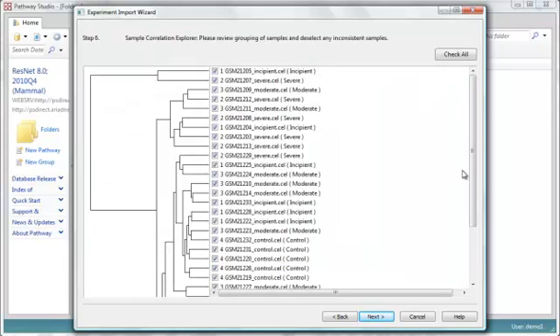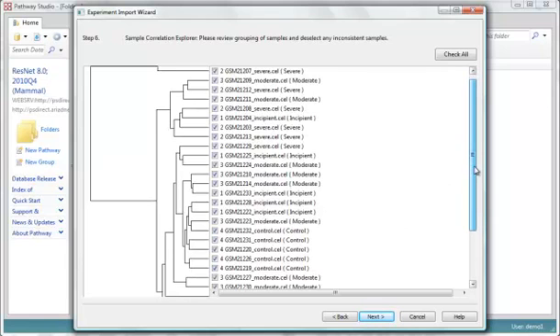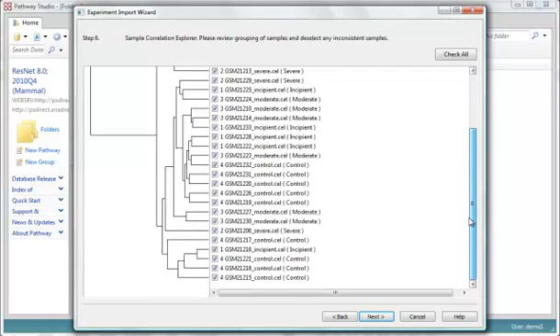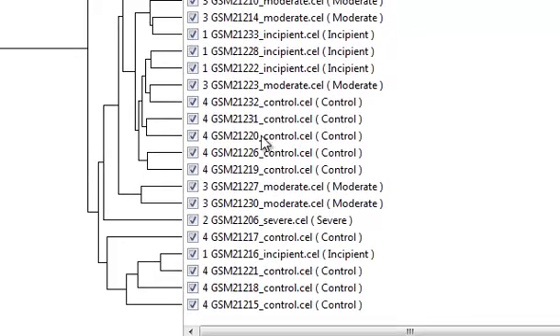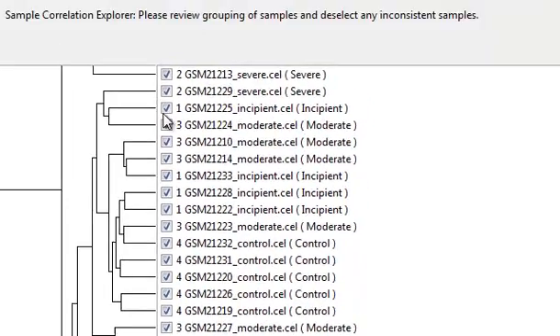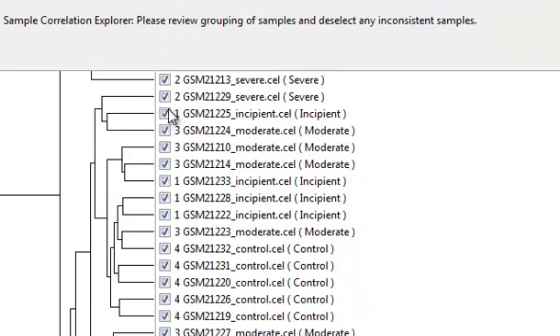So now I can look at this, I guess this is called a sample correlation explorer. And I can look at how my samples are oriented. Right away I see one that looks like an outlier. I'm going to take that one out. It shouldn't be in that group. The same way that this one shouldn't be up here.